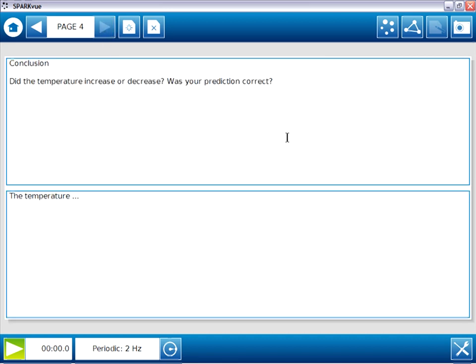Finally, page four has the same two page elements and the same design as page two, that is two large text boxes, one atop the other. Now that we've taken a look at the final lab, I'm going to go ahead and construct it.